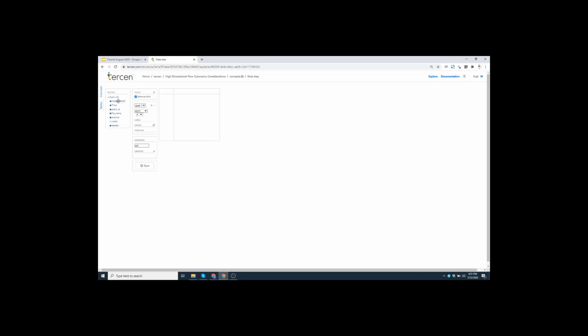This was in the data set. You can view them or you can see them as column headers. But you see here I have the measurement, the time channel, the event ID, the file name it came from, the channel name. As I mentioned, Flow Cytometry has these channels, the row ID and the table ID. So I'm going to take measurement since that's what we want to look at.